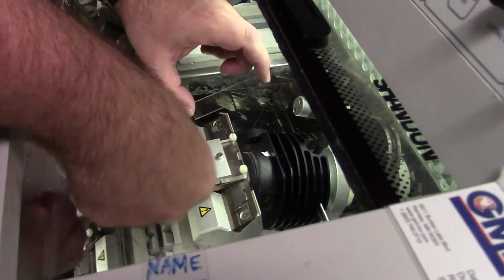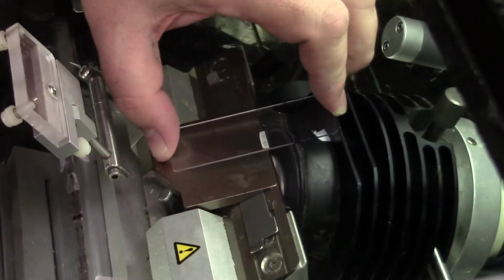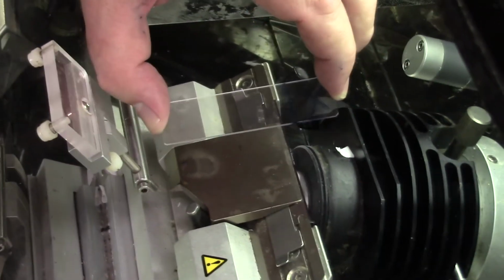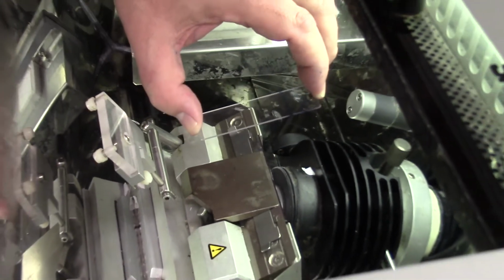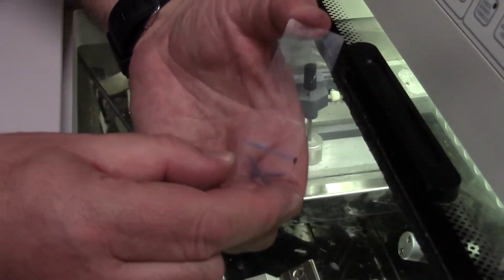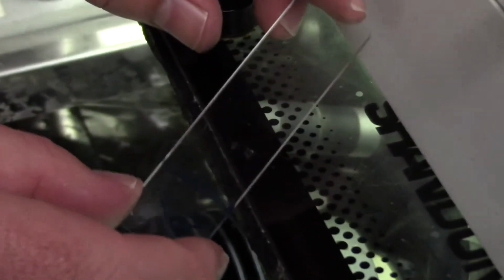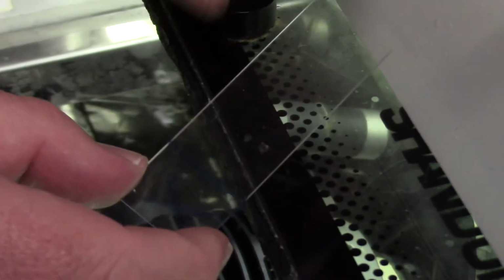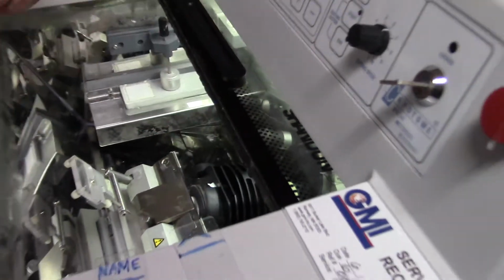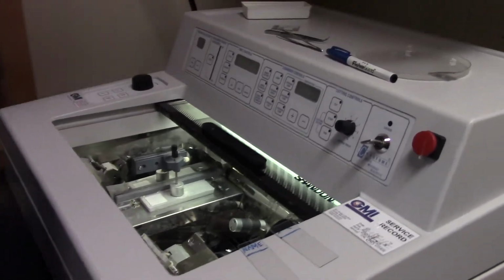I'll try it once with my left hand. I don't care if I mess this one up. Okay, move this out of the way and pick up the piece of tissue. Oh, I did pretty well. I can do that with my left hand, no problem. There's our piece of tissue. If I have a black background, can you see it? Yes. So two pieces of tissue side by side. The bigger one is what? Good thing we had them separate. We know that the big one is our stump, not our regenerate.